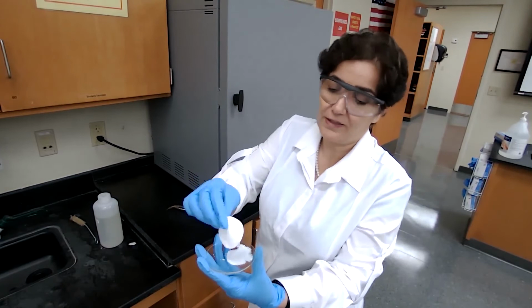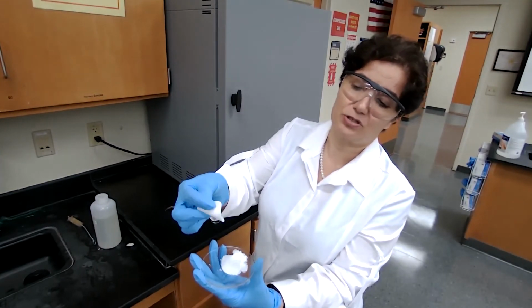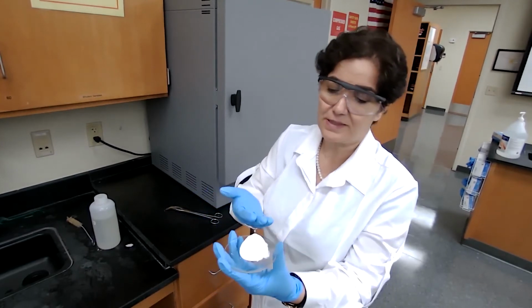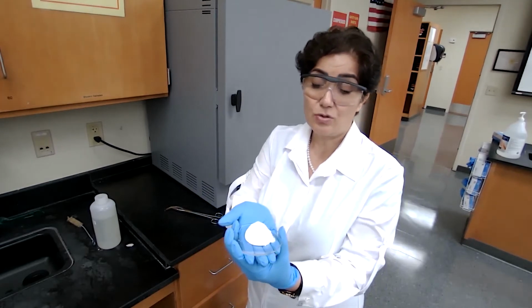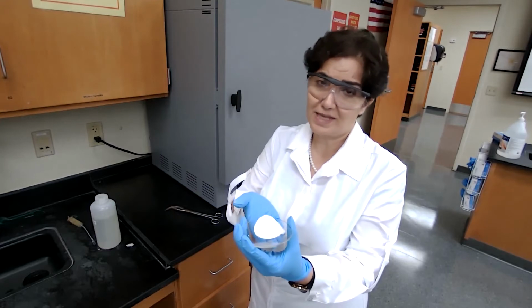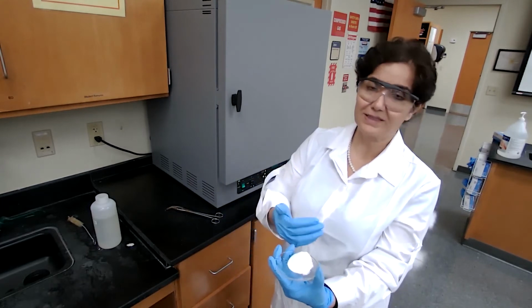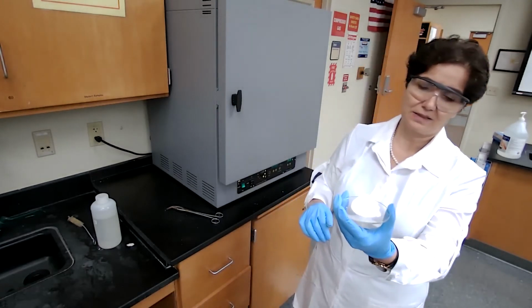It's hard to feel it from the video. Of course, either you can trust me or you can see the texture. This paper is dry, and since it's dry, it tells me that the sample is dry. By the time I take it to the scale, it's going to cool off also, because we should never weigh objects that are hot. After we measure the mass, we prepare the sample for melting point, and we measure the melting point of this benzoic acid as well.